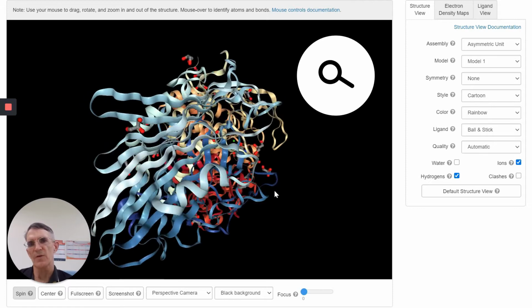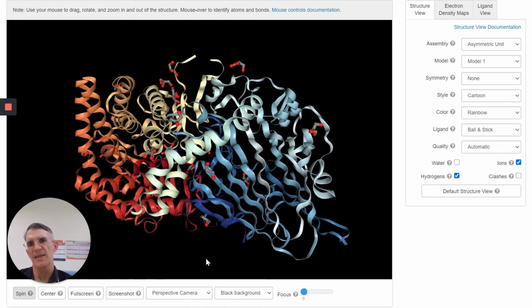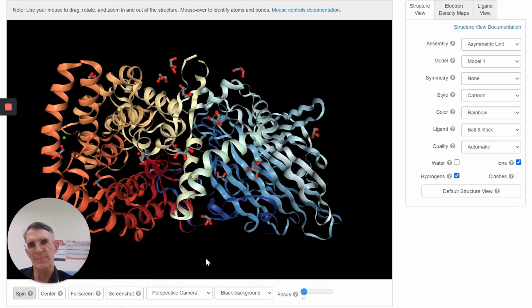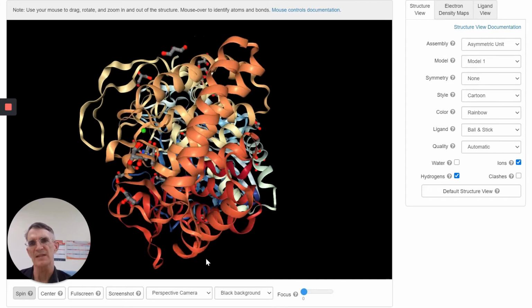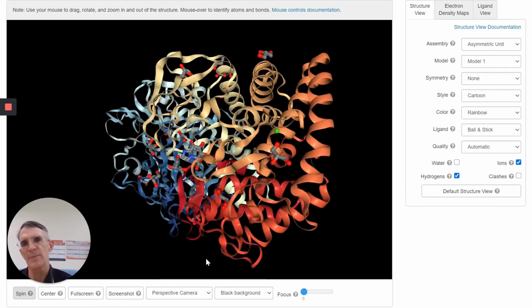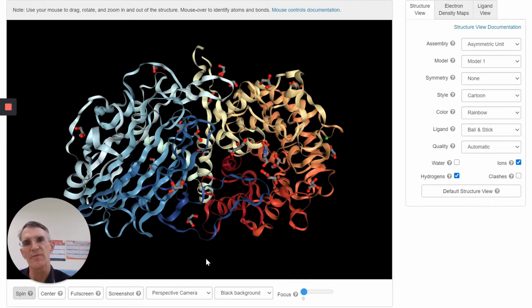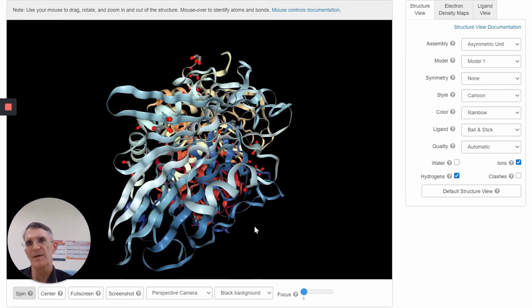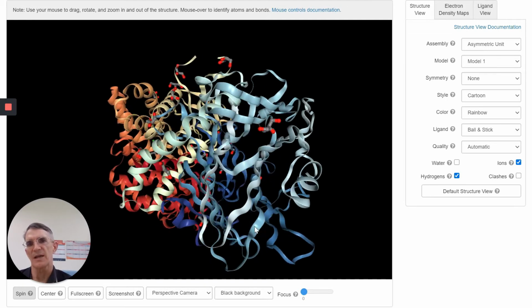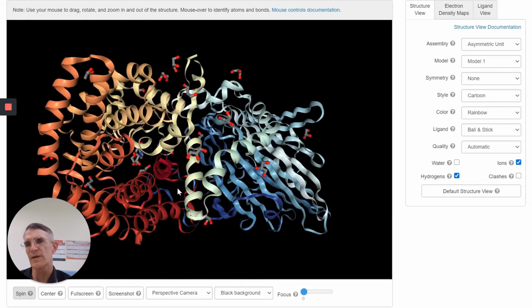Sometimes we have to go into the plant or human cells, and then we extract, say, lipids and use mass spec to tell us which lipids are there in metabolomics, to see if we have too much of an enzyme or none of the enzyme, what happened to those metabolite levels. So we're working at many, many different levels in our lab, but it's all about protein function. What do the proteins do, and how do they do their function?